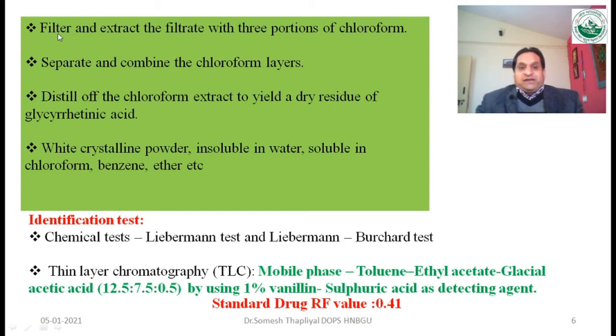Then, followed by the filtration, extract the filtrate with 3 portions of chloroform. Now what you will do is you will filter that extract and filtrate. You will again take different 3 portions of chloroform.